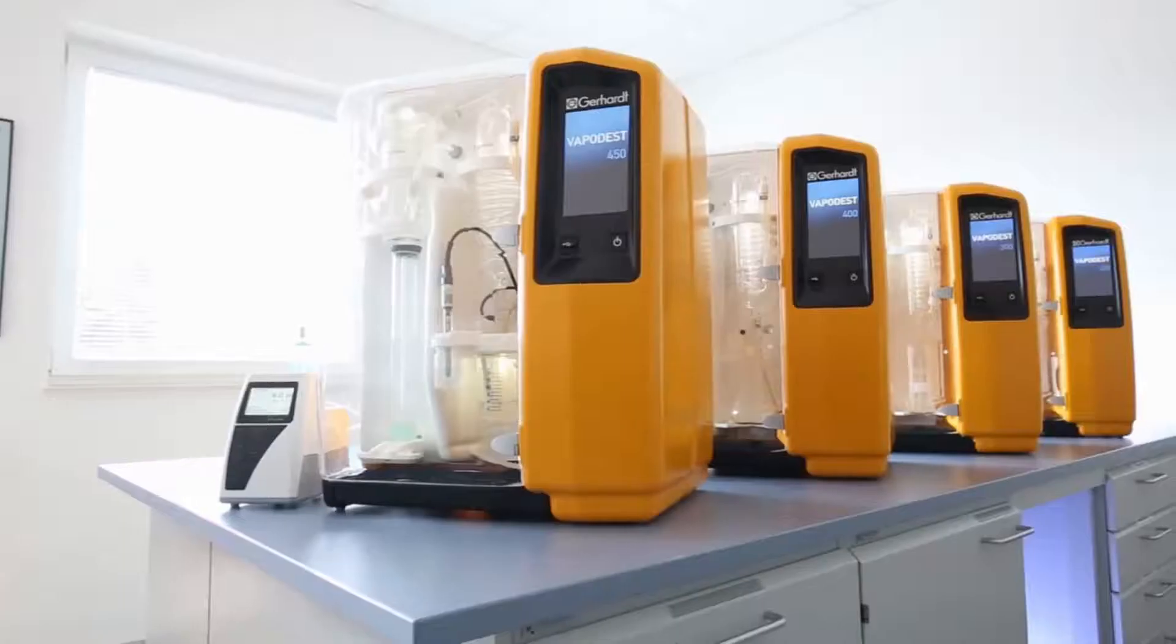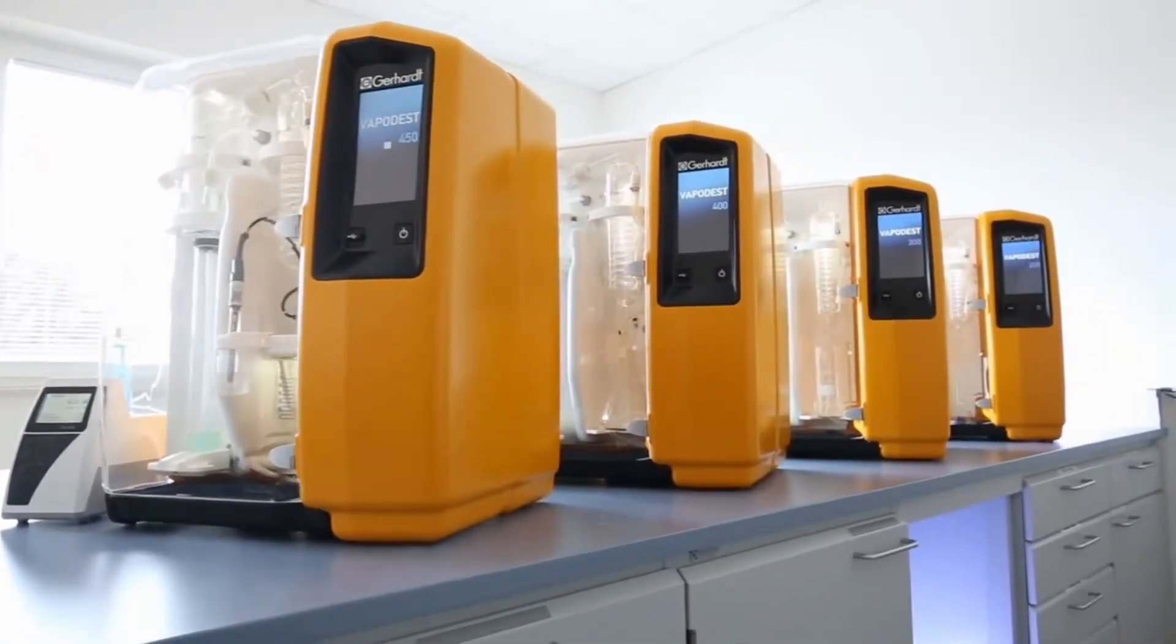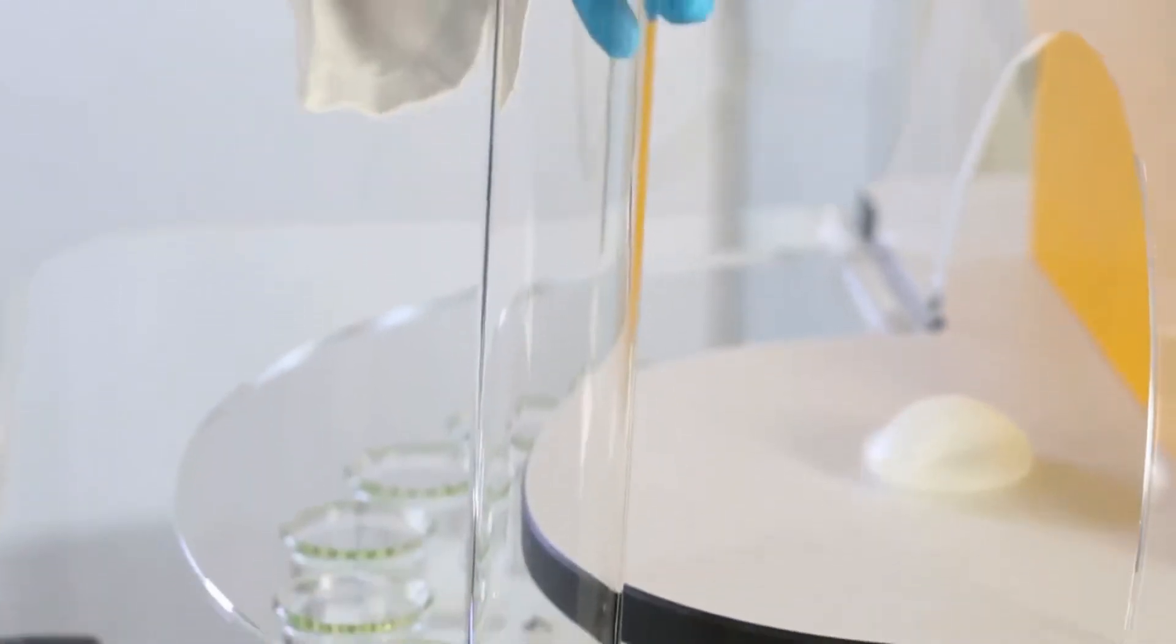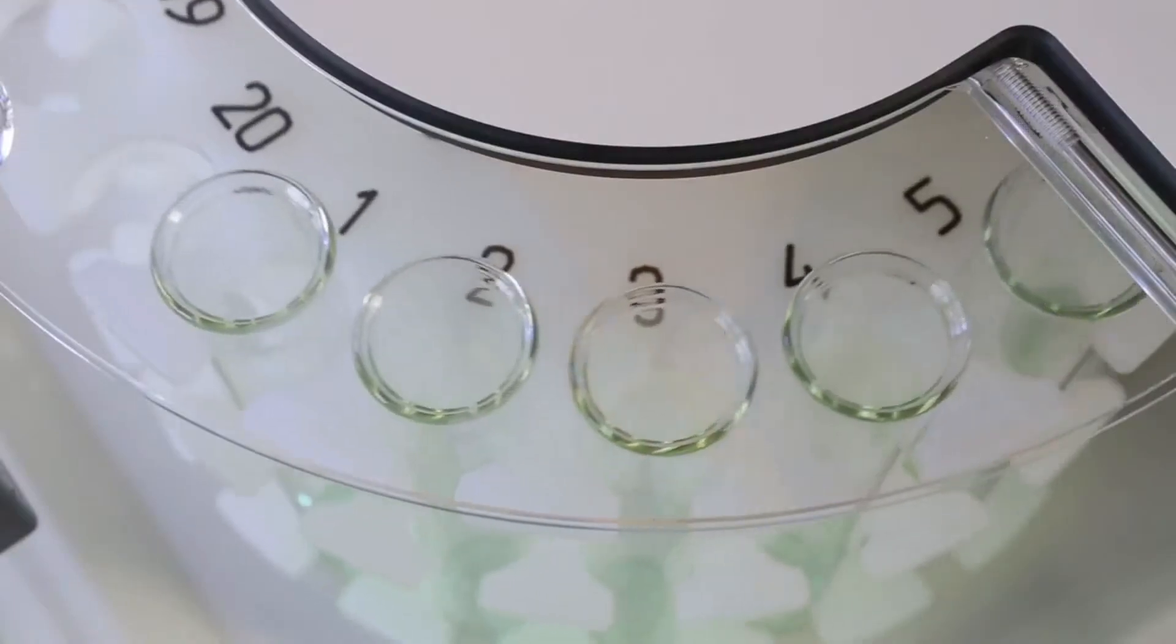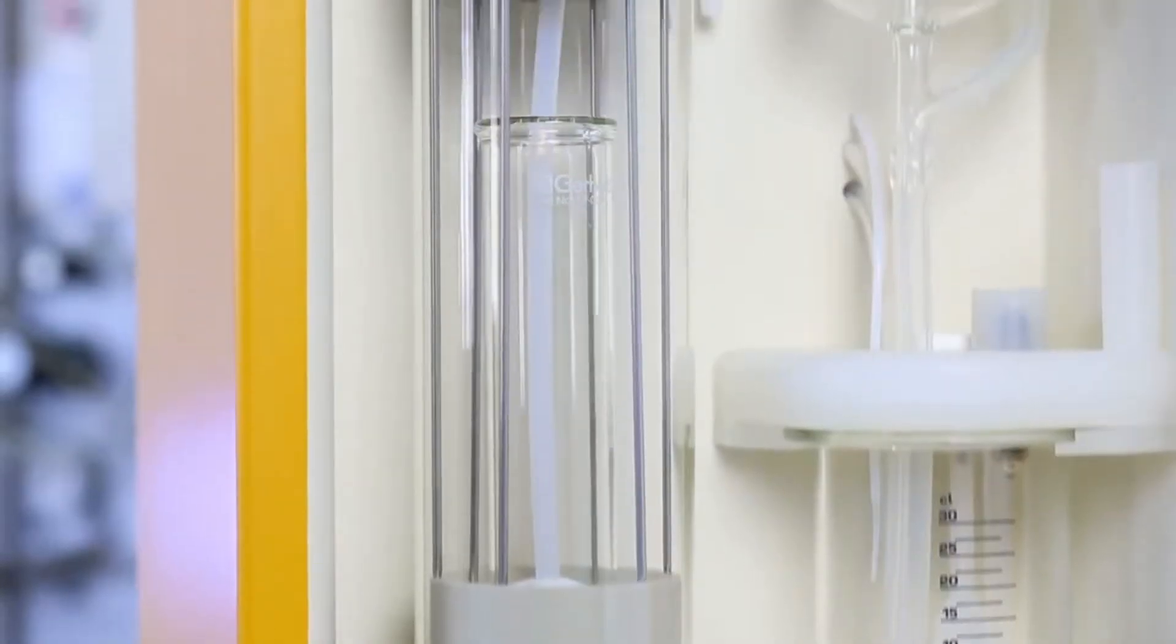The VapoDest model series is available with different levels of automation. From the smart version for low sample volumes, through to full automation with integrated titration and sample changer for high sample throughput.